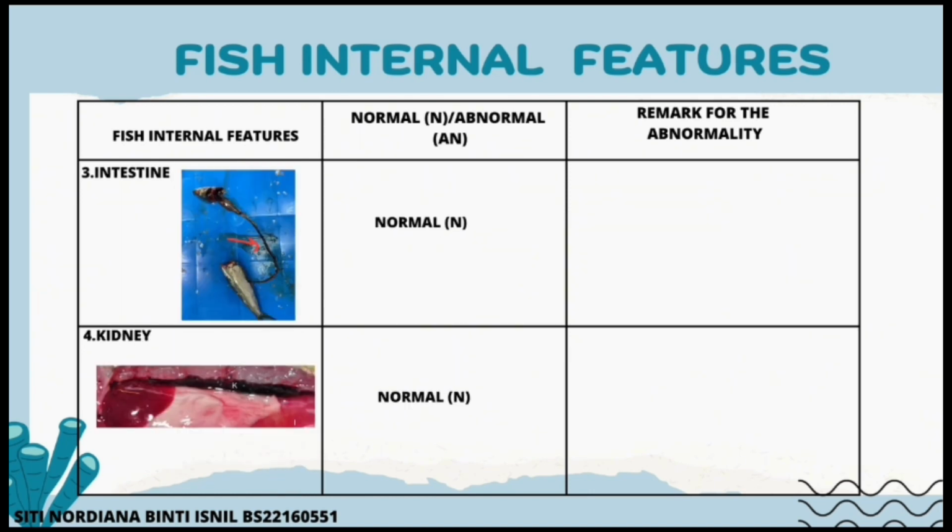Moving on to the intestines. The intestines of fish are responsible for nutrient absorption and digestion. They play a crucial role in breaking down food into smaller molecules that can be absorbed by the body. Examination of our specimen reveals intestines that are healthy and functioning efficiently.